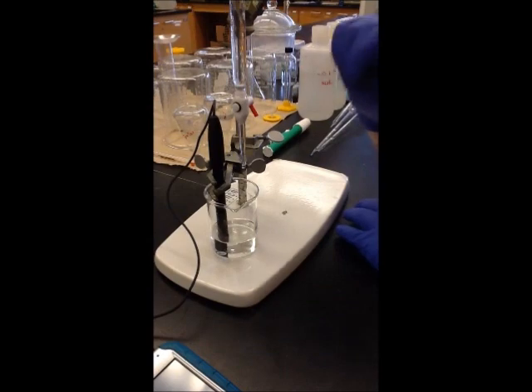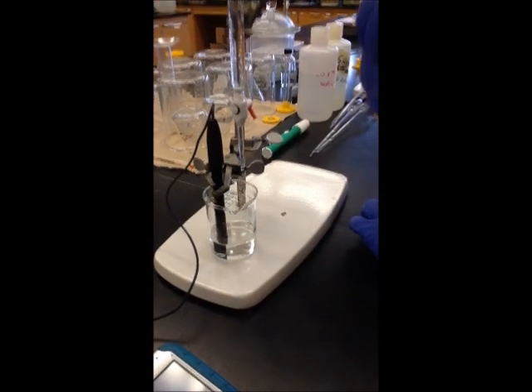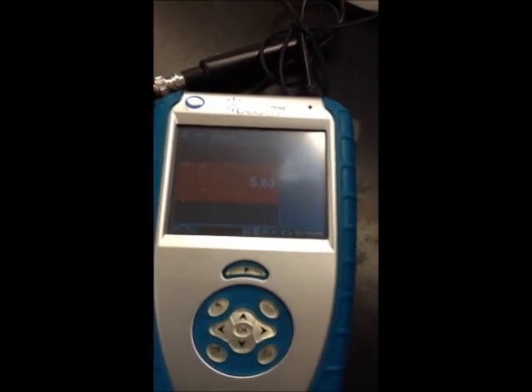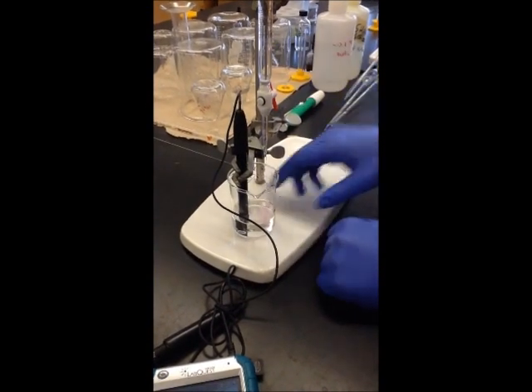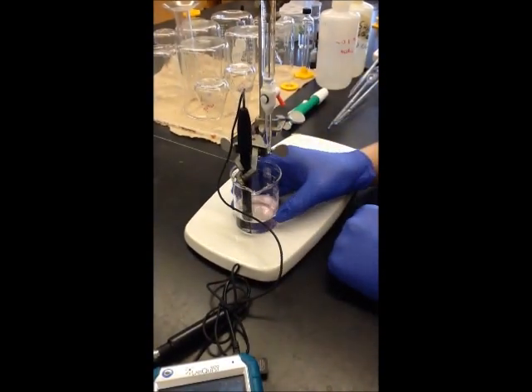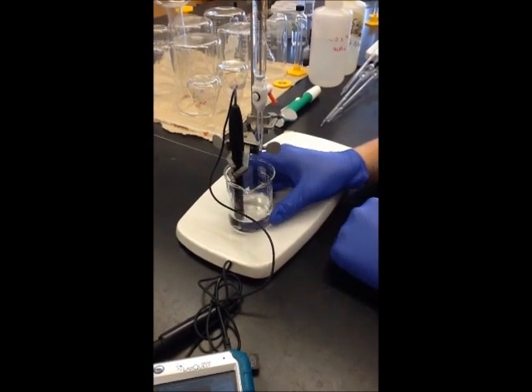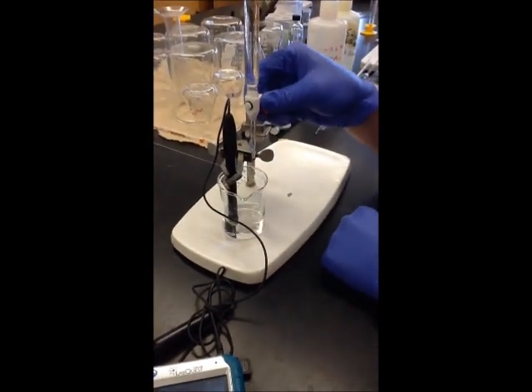As indicated by the pH, it's at about 5.84 right now. So I'm going to keep adding relatively slowly here until I can't get rid of the purple color by stirring anymore. And that went away, so we'll add more.